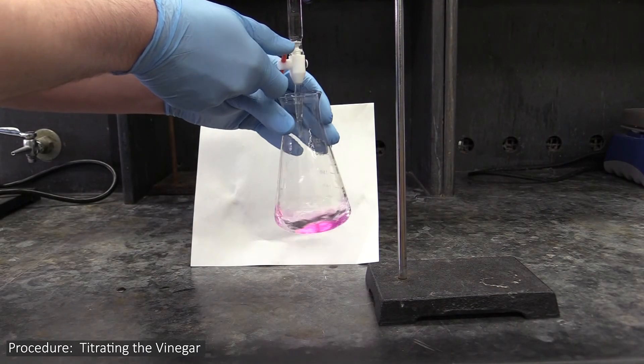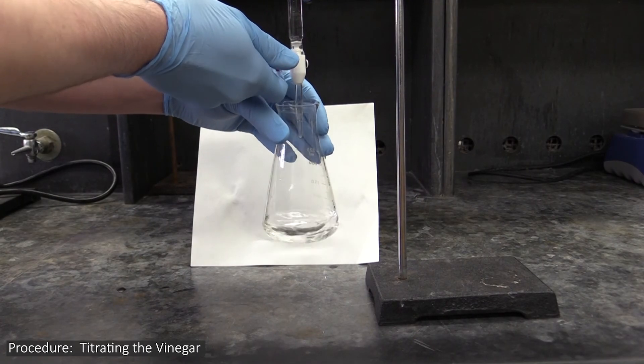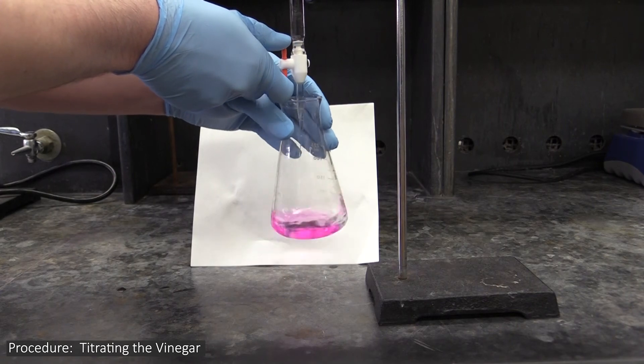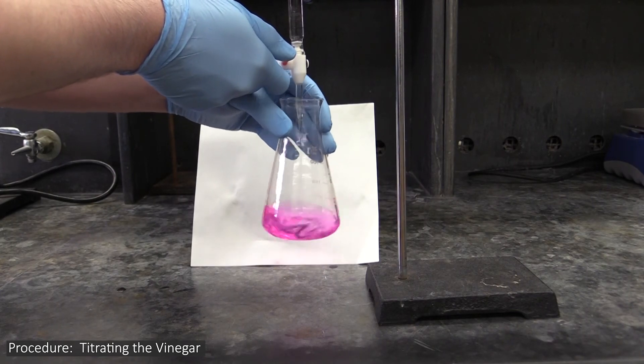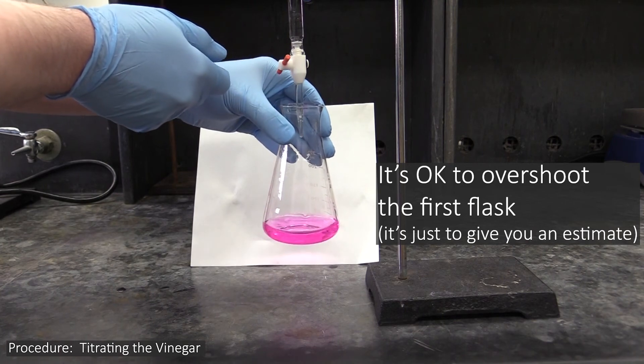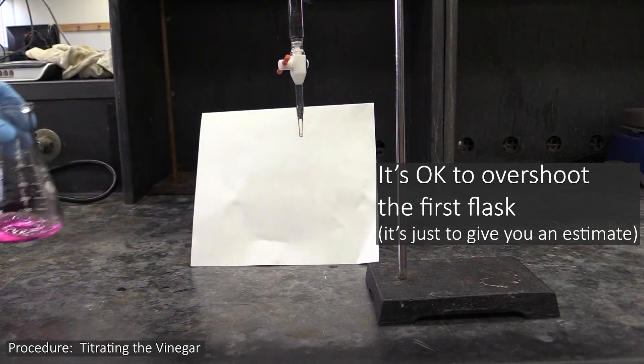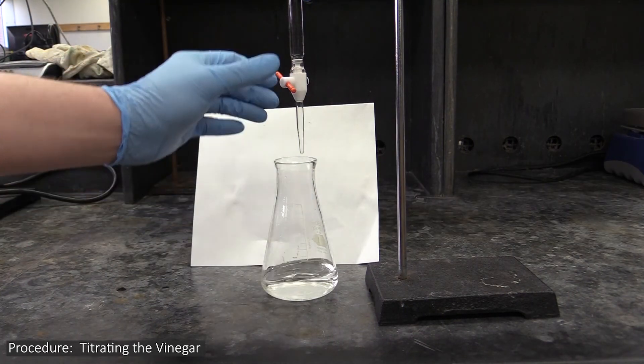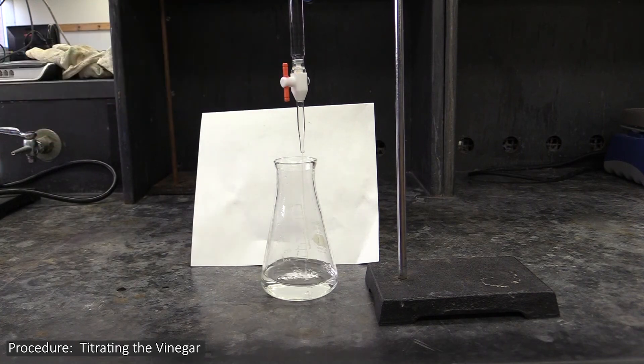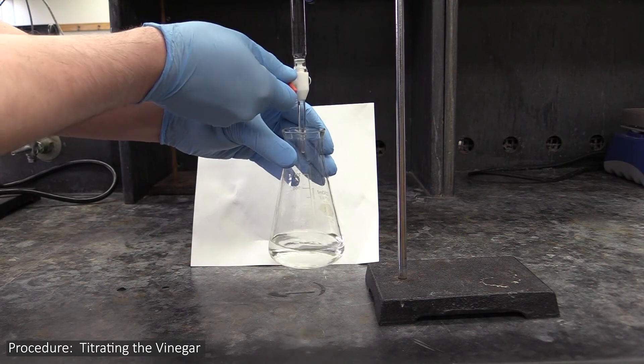Titrations can be slow, but there is one thing you can do to make this experiment go a little bit quicker. Don't try and be super careful with the first flask you titrate. Do it quickly to give yourself a rough idea how much titrant you'll need. Once you know that, on the subsequent flasks, you can crank the burette valve wide open to bring them close to the endpoint, and then go very slowly and carefully from there.